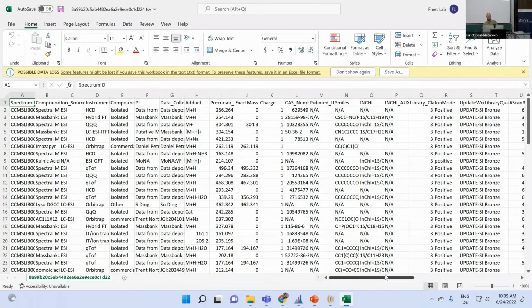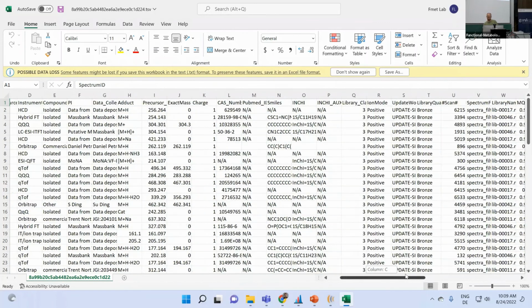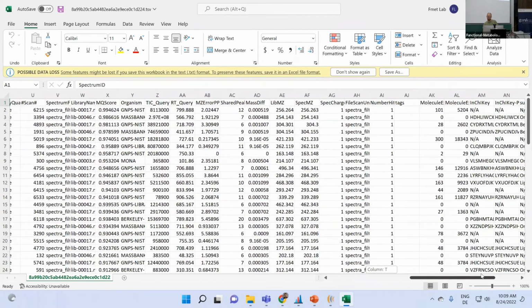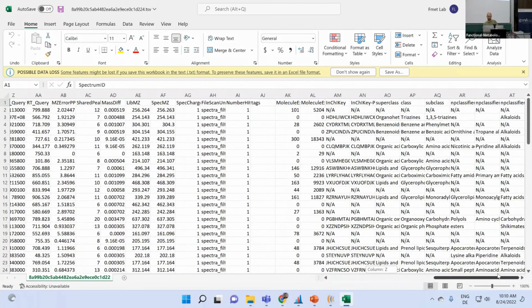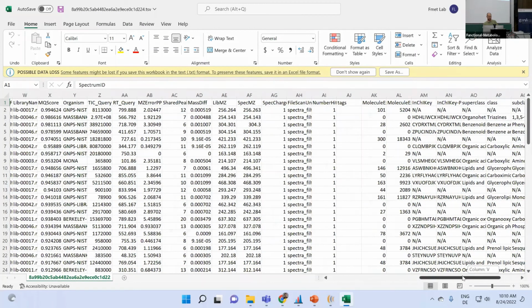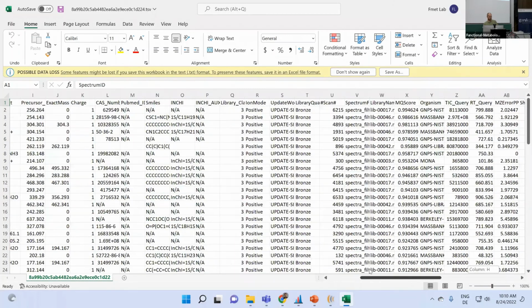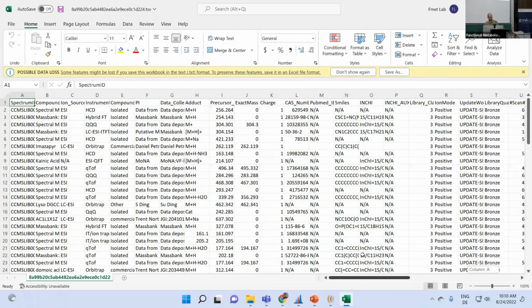And now let's see, there's much more information visible than in the initial view. So now we also have some classes here. There's the InChIKey, and there should be the SMILES somewhere too. And then, wondering if the source, yeah, nice.